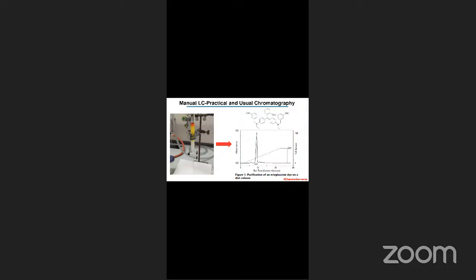And after a while, you see different bands, like in this case, red and yellow. Those bands essentially mean that in that particular solvent, the two samples are separated, because chromatography is a science of separation of mixtures, nothing else. I'll give you the definition as I go along, but you can understand why we always discuss chromatography. And I can assure you, mostly organic chemists spend most of their research time doing separations. It's easy to set up a reaction, but it's always a tricky and difficult business to separate the molecule. And that's how chromatography has come up as one of the most innovative ways of doing the science of separation.